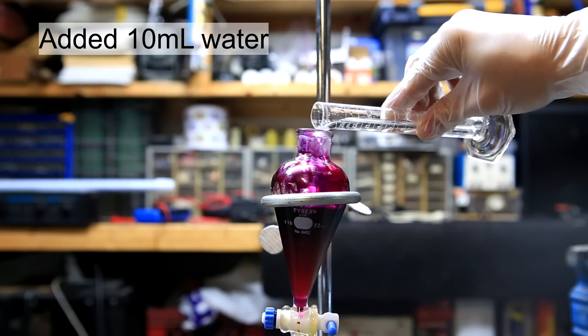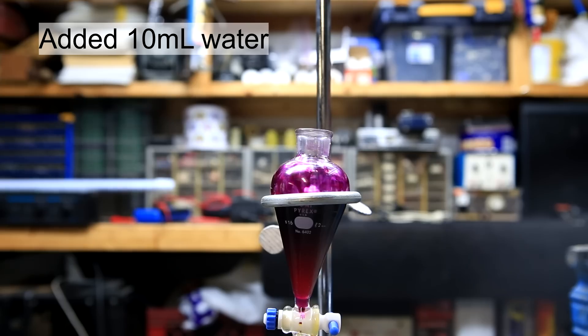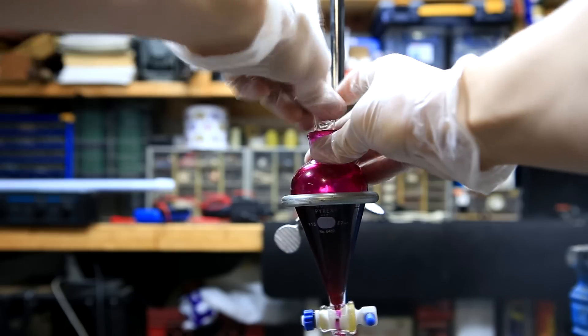Afterwards, 10 ml of water is added to make sure we dissolve as much of the salt as possible in the water layer. And for one final time, the separatory funnel is capped, shaken, and vented, and then the layers are allowed to separate.